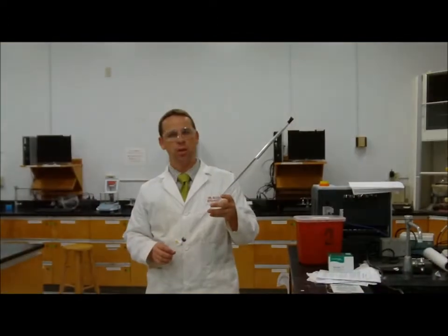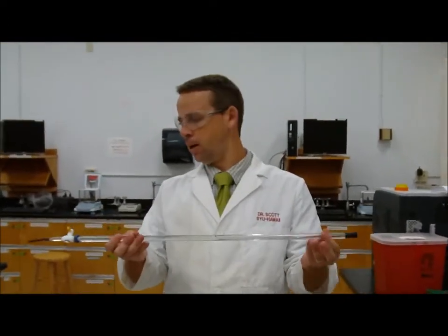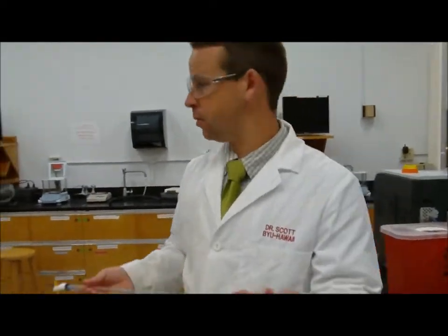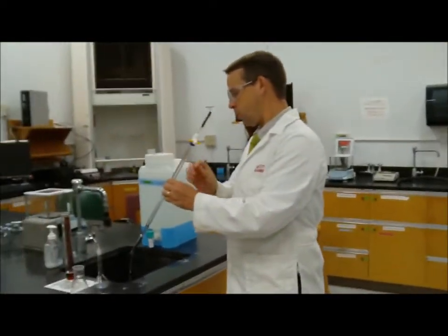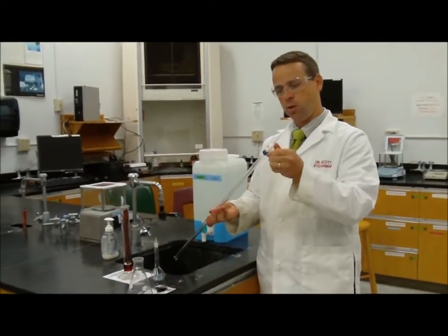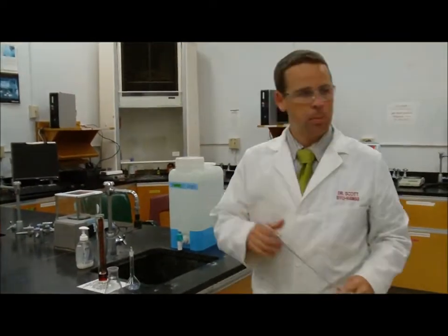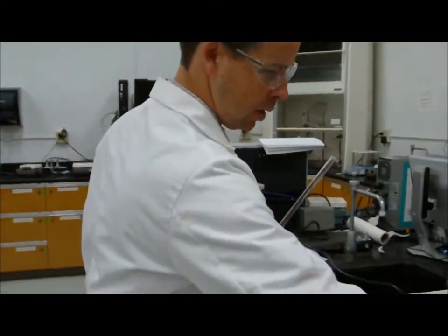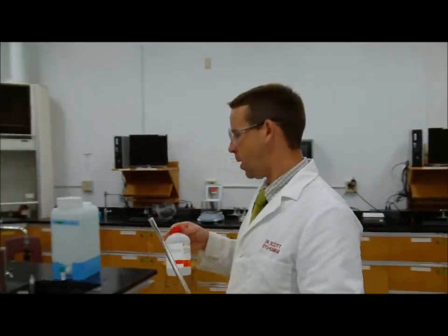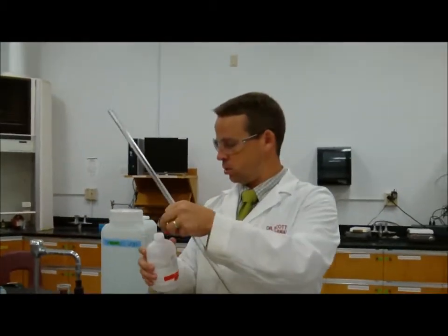All right, so I'm going to show you a kind of cool titration that I like. Here we have water. I just got this from there. So first thing I want to do when I'm preparing my burette, obviously, is remove the cork and remove the storage water that's in there. Then I'm going to want to rinse it with my solution, my titrate, whatever it's going to be. This here is a sodium hydroxide solution.